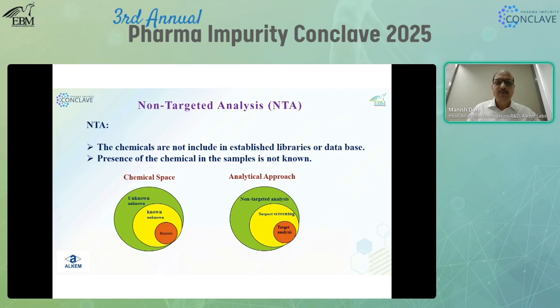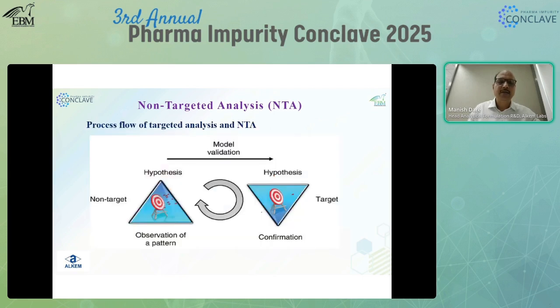Coming to the analytical approach, when developing any method, we have to have a target for each and every impurity. That impurity may be a process impurity, a degradant, or come from the matrix, excipients, or placebo. Apart from these, for unknown impurities there may be a certain target limit as per ICH.